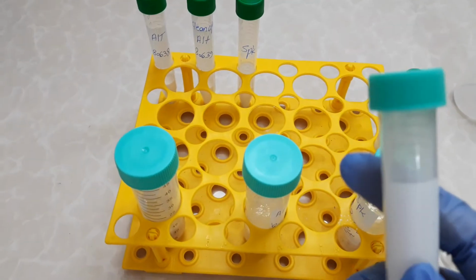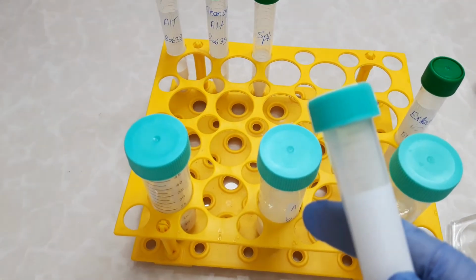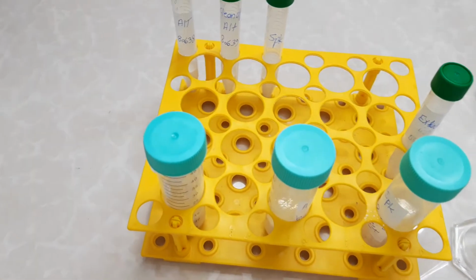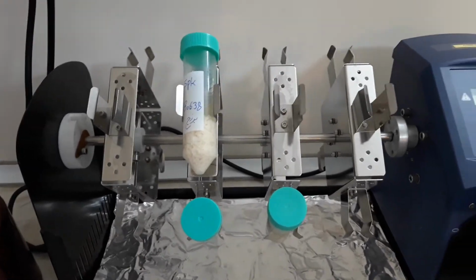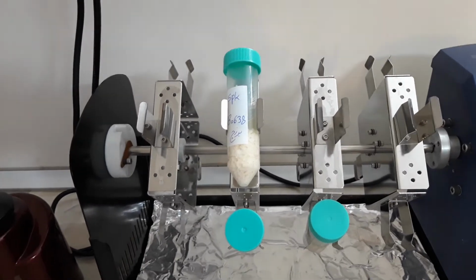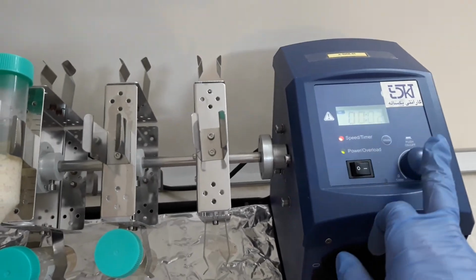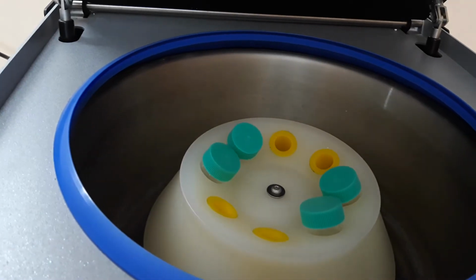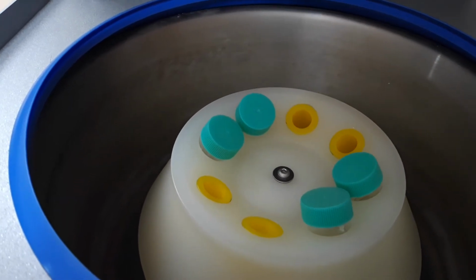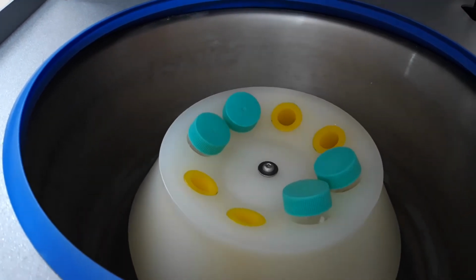Unfortunately, I forgot to tell you that we also use sodium chloride in this extraction kit. Okay, after adding the extraction kit, we put the sample in the shaker and shake it for about 2 minutes. In the next step, we put this sample in the centrifuge at 5000 RPM for 5 minutes at 5 degrees Celsius.